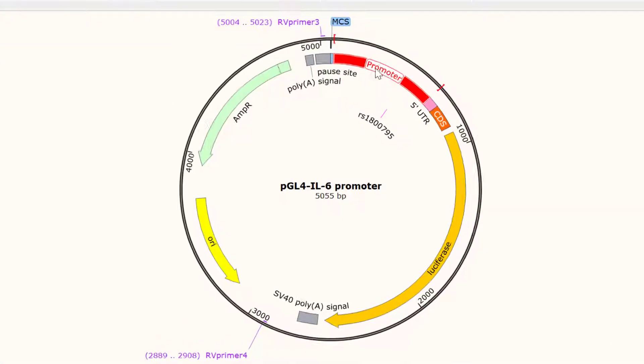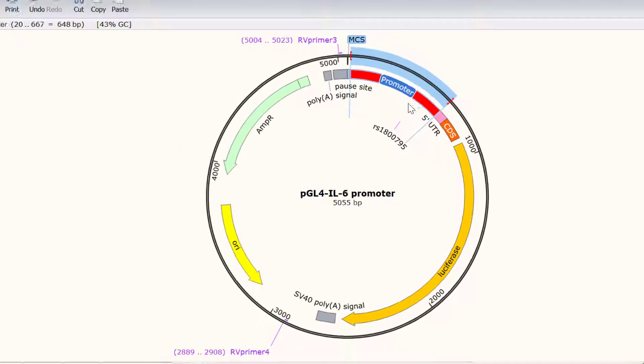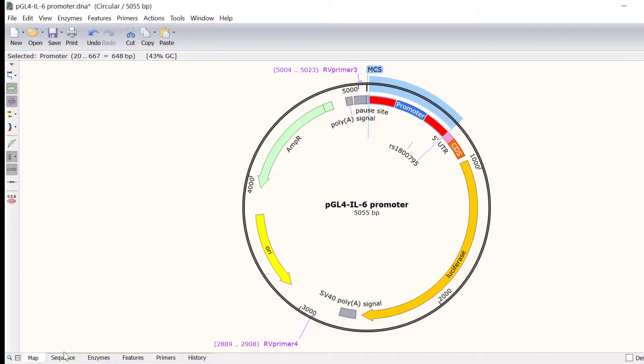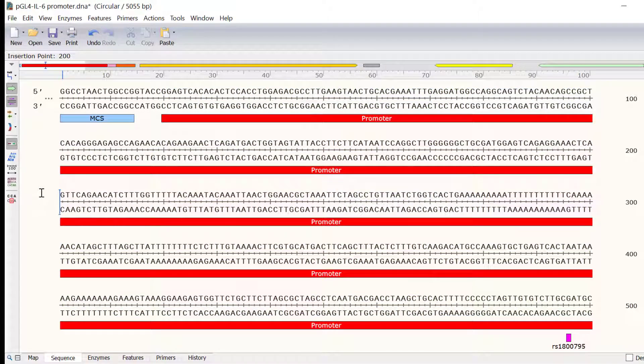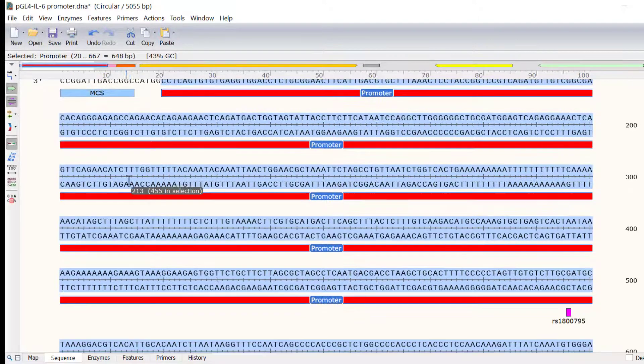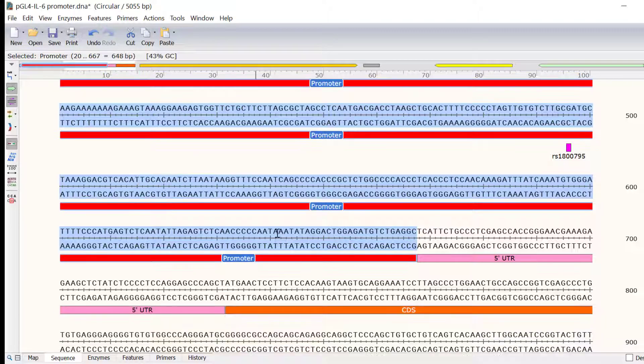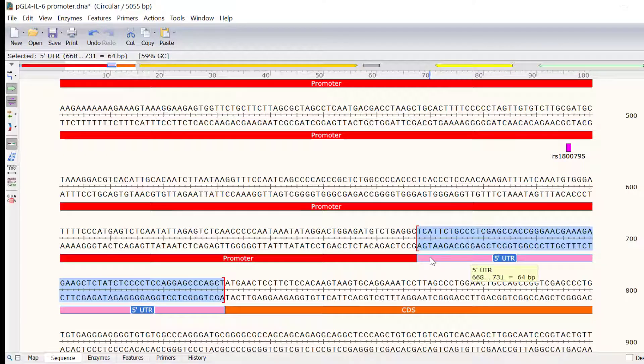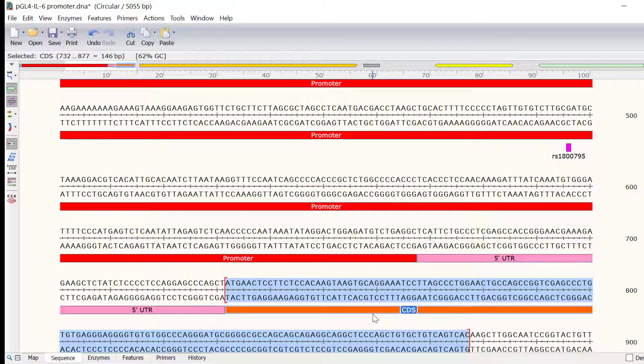The promoter region can be seen here by this collection of features. Let me now switch to sequence view to get a better look at these features. The red feature corresponds to the interleukin-6 gene promoter, and the rose-colored feature is the 5' untranslated region. The orange feature is part of the coding sequence, or CDS.